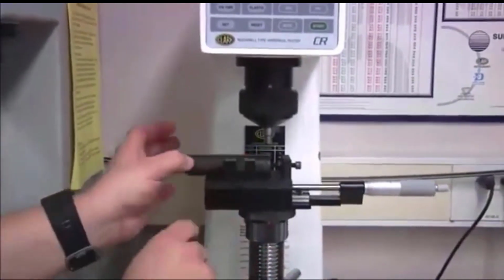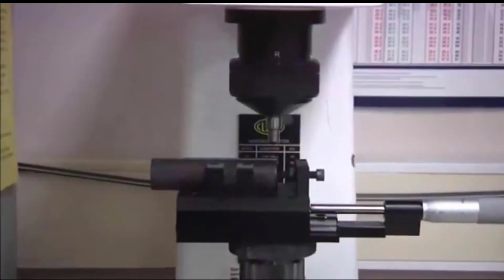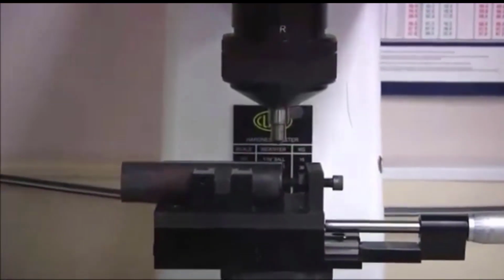All right, and then this clamp just holds the bar in place. So I press the bar against this screw on the end. And now I'll raise it up to the point where I can see the reflection of the indenter tip. All right, I want to get within about 1 millimeter of the surface so that I can see the reflection of the indenter tip. But I don't want to actually touch the surface.